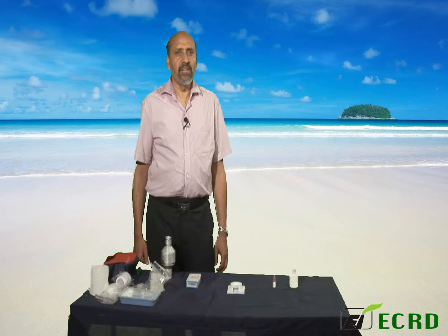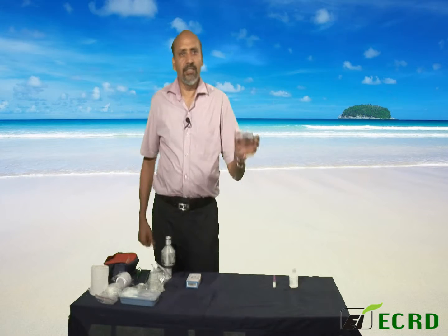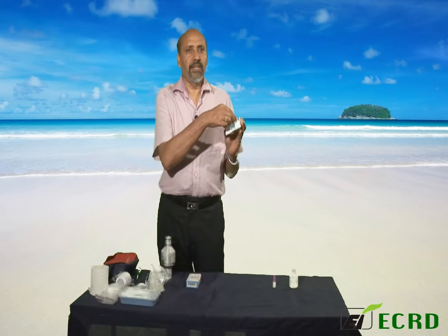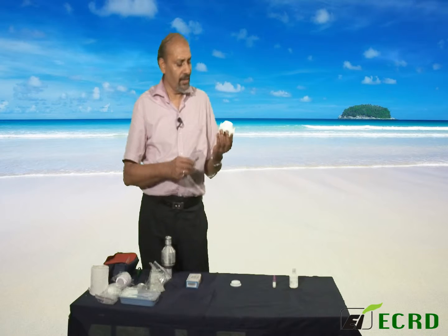The fine particle sampler uses a special membrane filter which comes in carriers like this. This is a very special filter, specially developed for this kind of measurement.